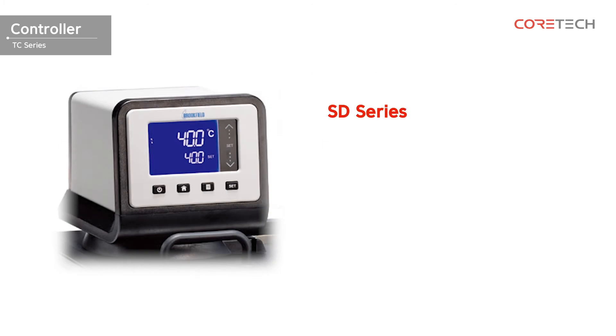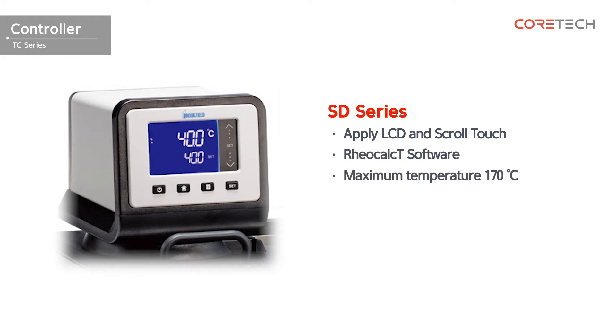This is the SD series. An LCD is applied, and quick scroll touch is also applied to enable temperature setting in individual mode. PC control is possible through LeaCalc-T software. Temperature can be set up to 170 degrees Celsius, ensuring temperature stability of 0.04 degrees.